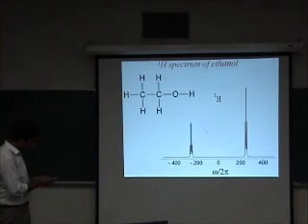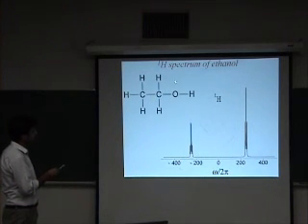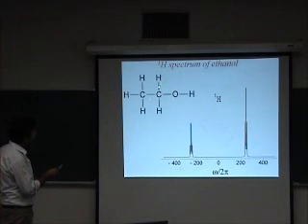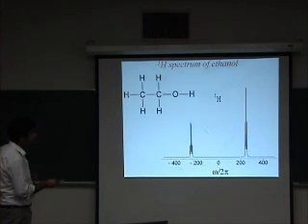अच्छा, इसी तरह प्रोटॉन स्पेक्ट्रम अगर आप एथेनॉल का देखें, you forget about the hydroxyl proton again, you look at this proton. This proton is coupled to a carbon 13, but let's talk about the natural abundance proton, the natural abundance isotopomer. This proton is coupled through 1, 2, 3 bond couplings to 3 other protons. So this proton will have a distinct chemical shift, and it will be split up into a quartet in the ratio 1 to 3 to 3 to 1.